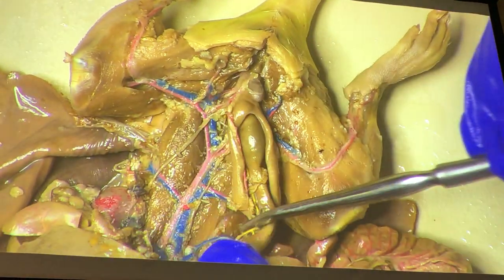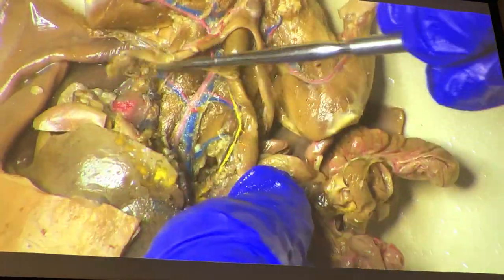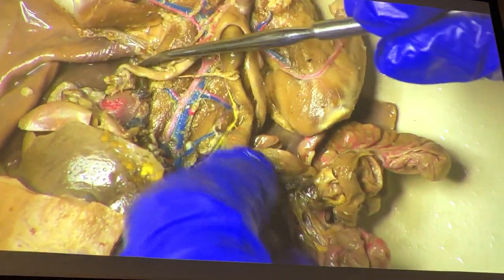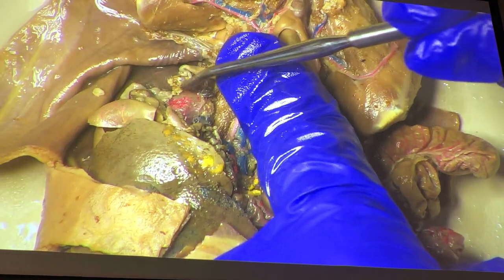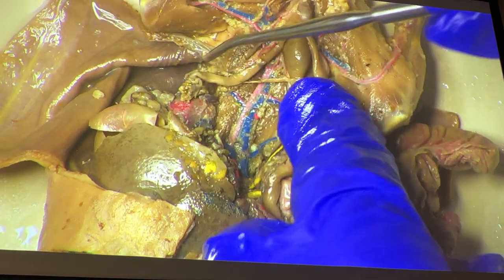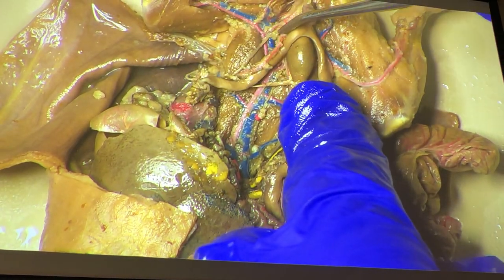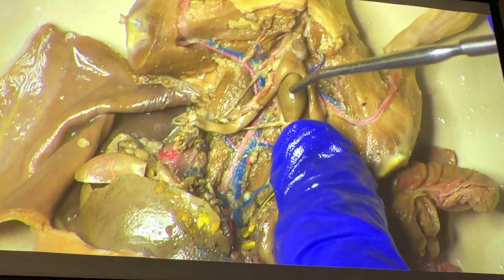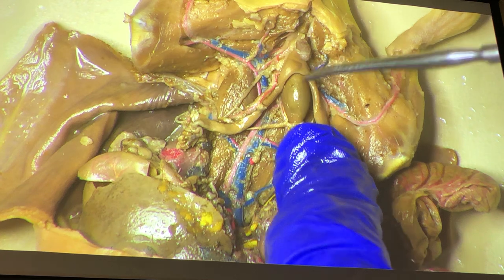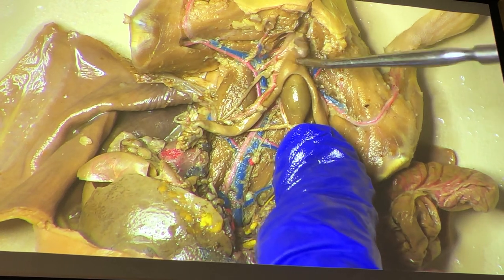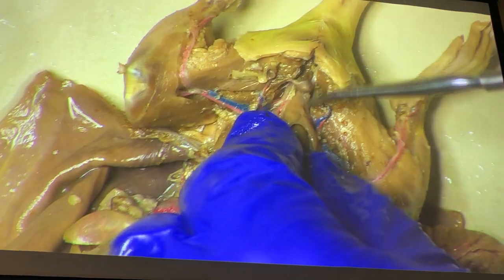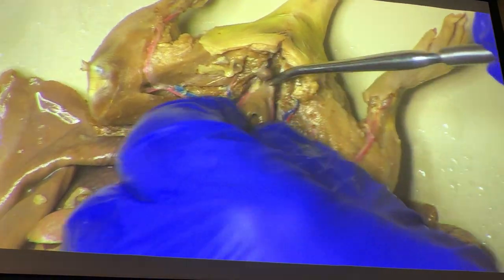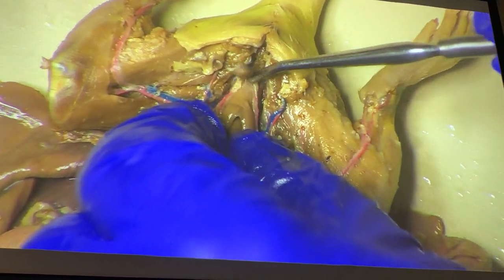Let's look at the female parts. Here is the ovary, the oviduct, the horn of the uterus or uterine cornea, the body of the uterus, and down below that the vagina, where it narrows dramatically right there.